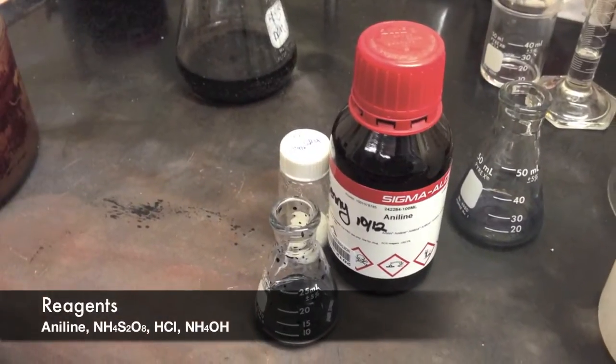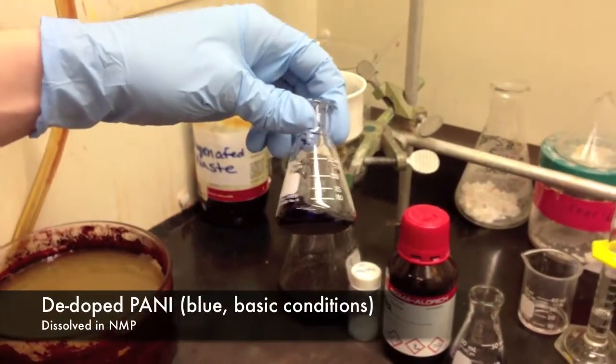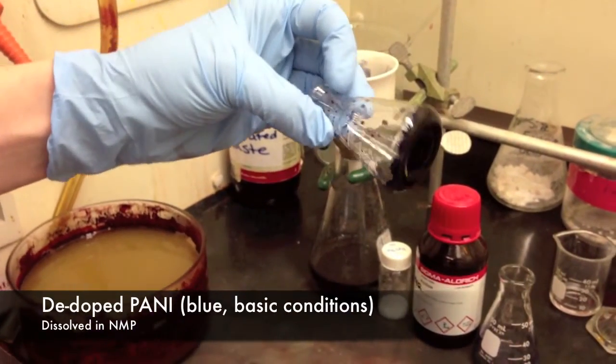We first synthesized polyaniline by the rapid mixing method, then washed and filtered with ammonia to de-dope our polymer. We then dissolved it in N-methylpyrrolidinone, or NMP.